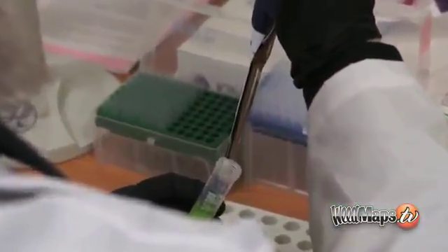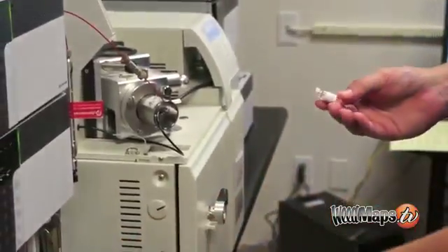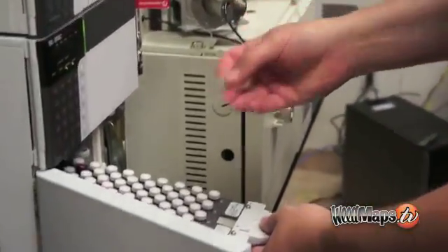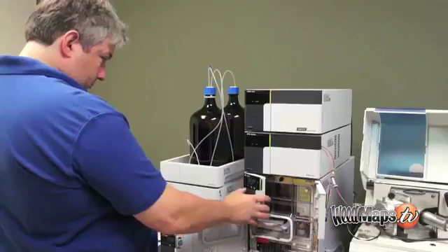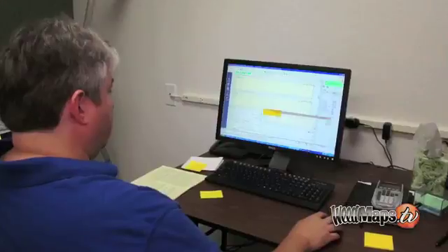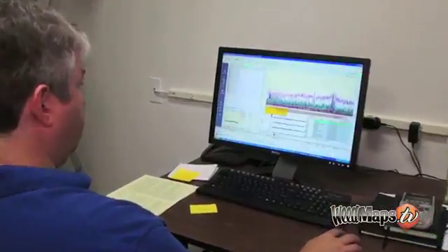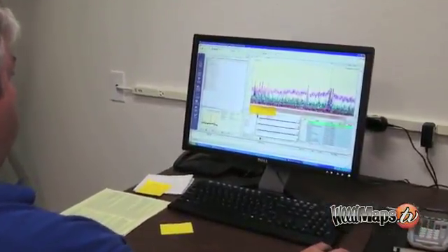Then it would go back to the instrument room where it would be put into sample vials that are used in our LC mass spec. The samples would be run in the machine, which is automated. After the machine is done, the data is then taken on the computer and all of it is evaluated.